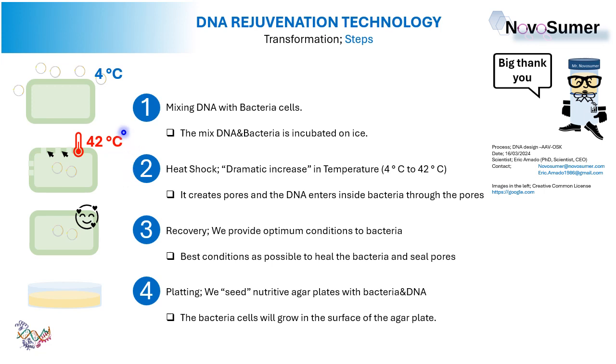This will create pores in the membrane, and the DNA will pass through the pores inside the bacteria cells. So now you know the heat shock creates pores, and the DNA enters inside the bacteria through the pores.